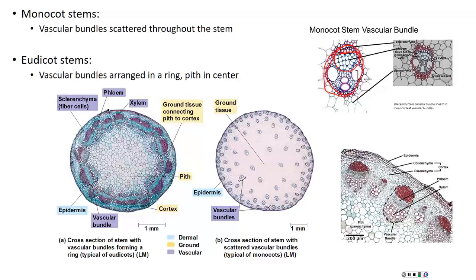In our herbaceous Eudicot stem, so here are our xylem cells. Xylem is, again, usually larger in diameter. Here's our phloem cell. And then we typically have a cap of thick-walled sclerenchyma cells on the top as well that help make them stronger. So, xylem, phloem, sclerenchyma. Xylem is usually the bigger, oh, I can't do it there, but you get the idea.